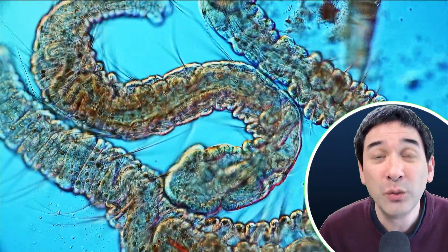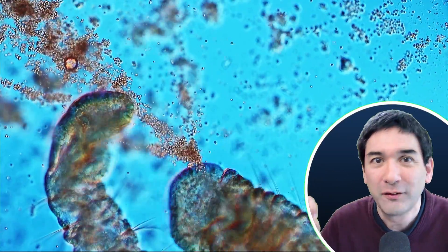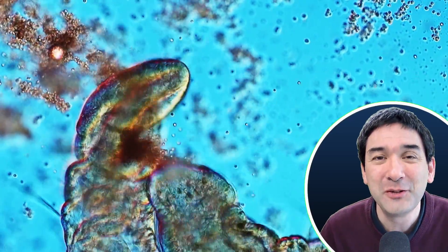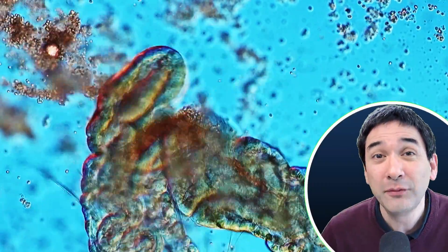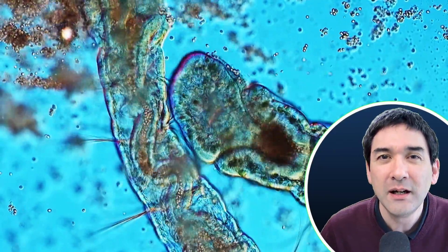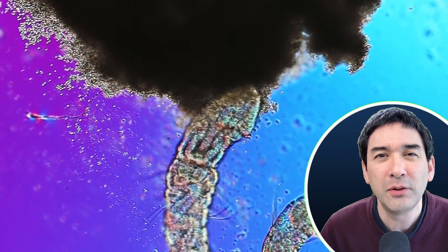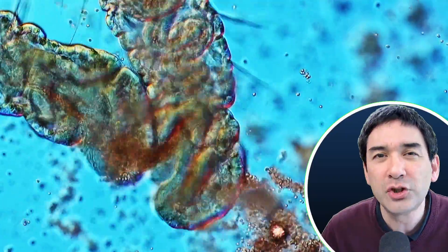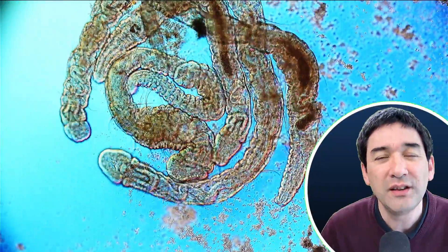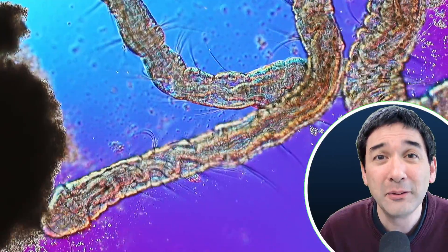There was actually even one case where one worm was trying to eat the yeast, and then a second worm came along and just stole the food right out of the mouth of the first worm. I also noticed that some of the yeast cells were kind of sticking together quite a bit — it was almost like they were in a layer of slime or mucus. Normally yeast doesn't do that; when you put yeast into water it dissolves completely. But here some yeast cells were still sticking together, which shows that the worms are apparently producing some kind of mucus that causes things to stick together. That's something I had not seen before.